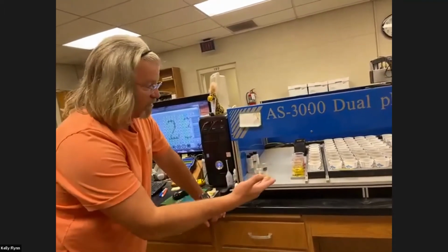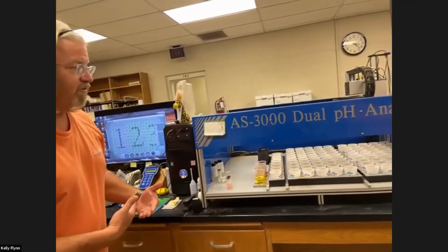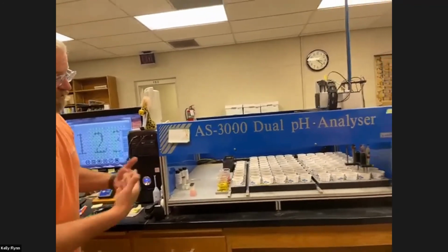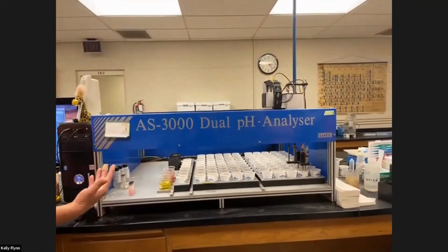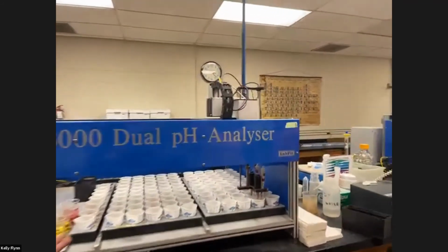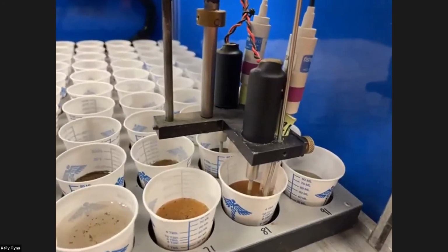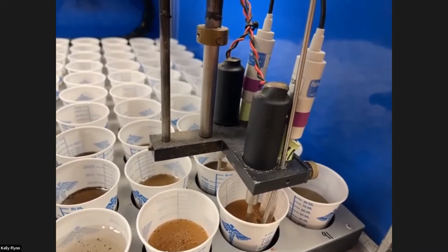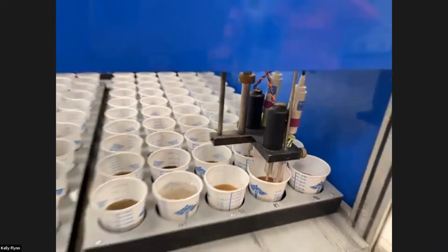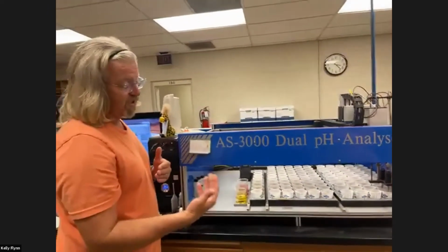But this is actually the second part. What I've done is I've taken a water pH first, and you'll hear all about this. This is now actually the buffer pH. So there's 15 mils of water, and after we take the water pH initially, we add 15 more mils of buffer, and that is basically mimicking the addition of fast-acting lime, and it is almost instantaneous. You can see the change in pH instantly.